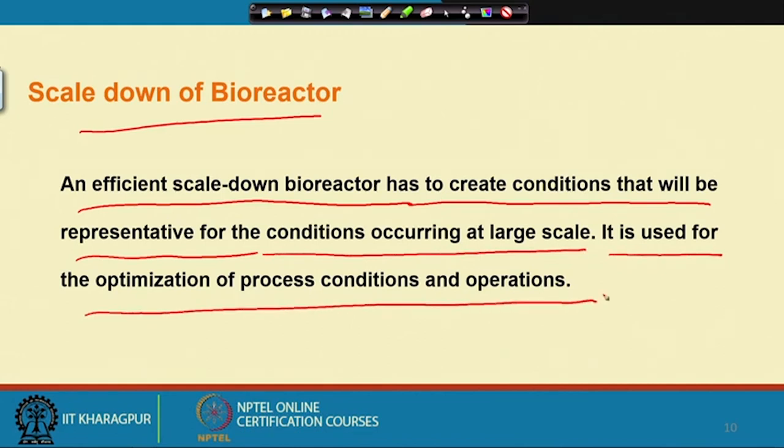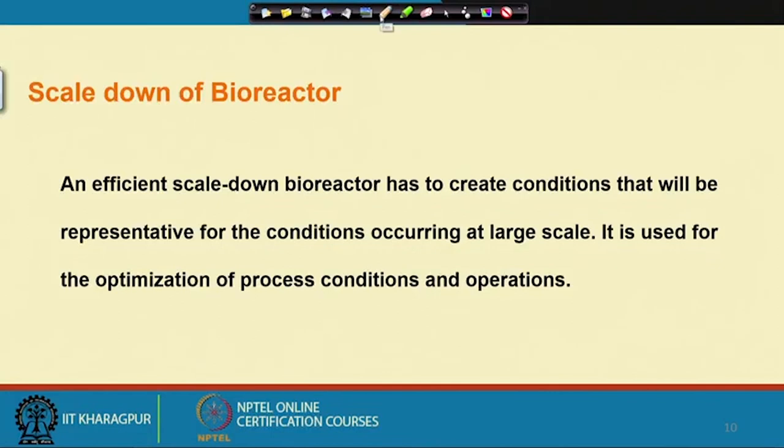This is the main purpose of scale down: we want to find out the optimum conditions for this particular process. That which we cannot do in the big scale, we shall always have to do in the small scale, and that we always consider as scale down.